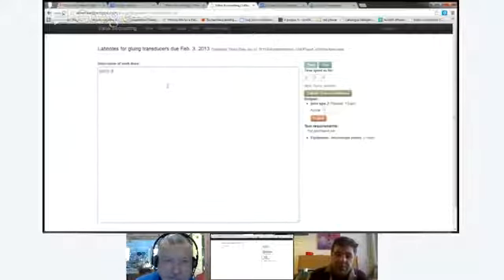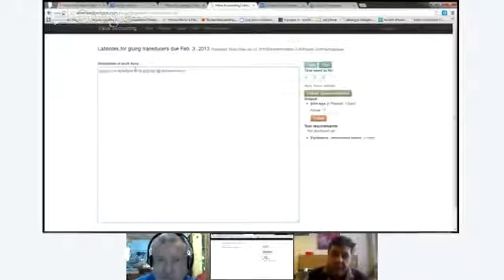Bob, what if the time you're working on the R&D project exceeds the time that you put in the beginning? There is a start date and a due date. What happens when you go back, day by day, to the lab note and continue working, and the time exceeds the time limit you set when you created the R&D project?